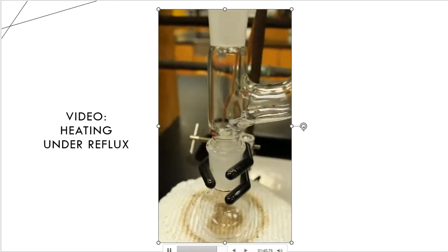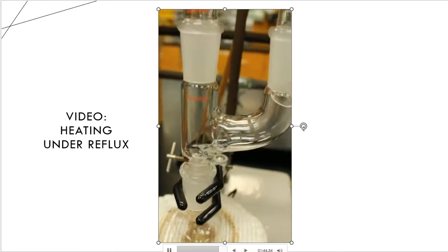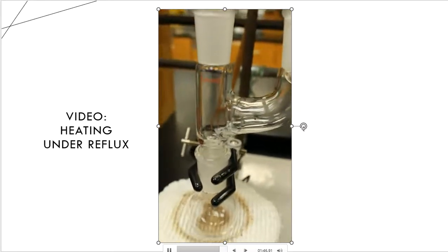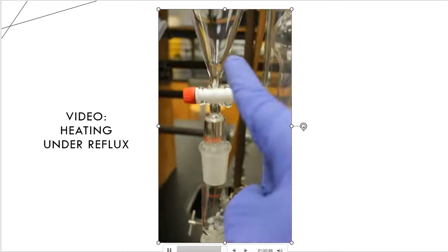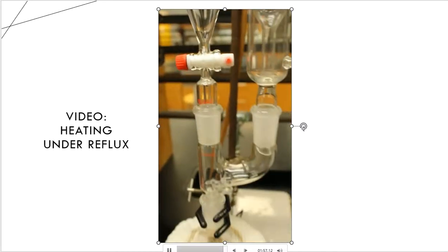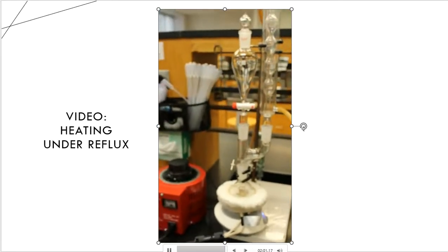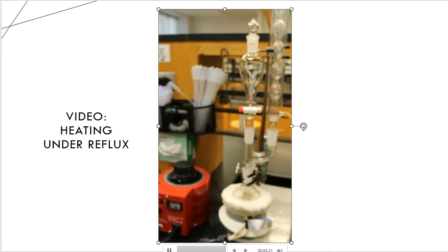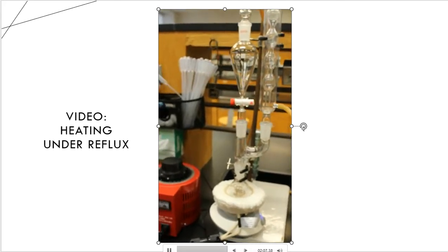That way, when the glassware gets hot, when this reaction goes forward, I actually don't have to touch it. I don't have to move it. I don't have to disturb it. It can actually add, do its thing with just a slight motion of the stopcock getting opened and closed back once I get finished. So that is the setup for what we call reflux under addition. All right, and that's going to be required for the Anisole lab.